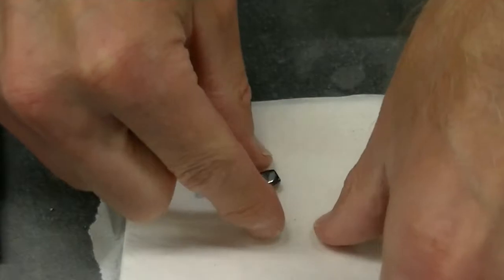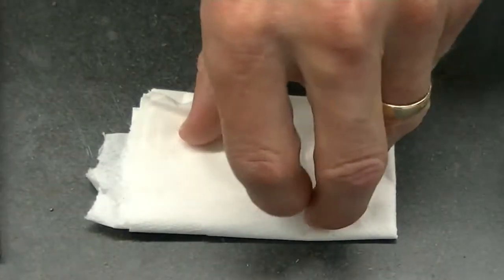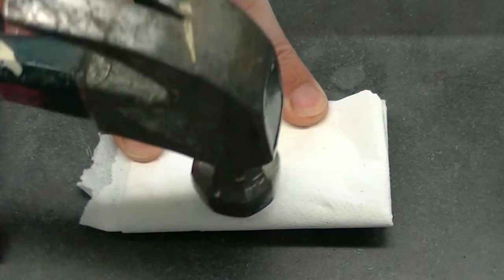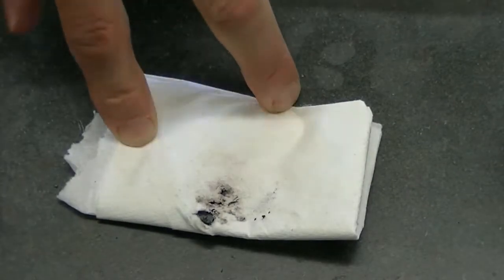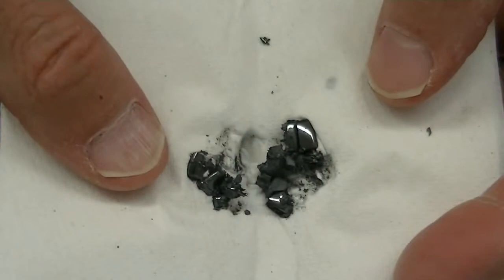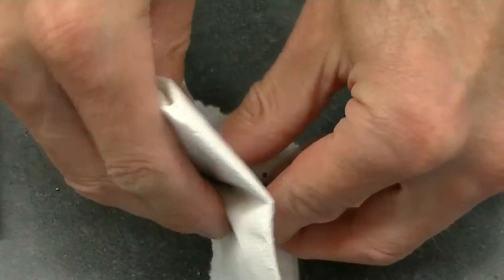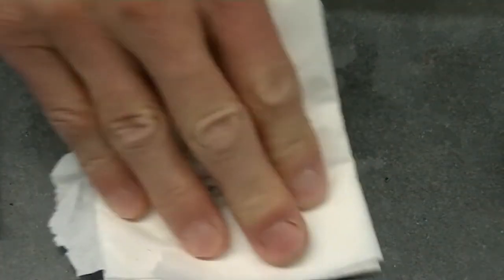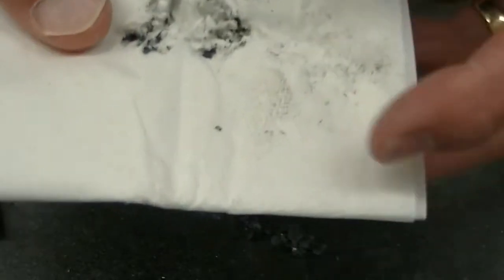We'll start with the beads sold as magnetic hematite. I'm placing it in a paper towel that's been folded several times. I'm going to pulverize it with a hammer. Let's take a look at the resulting powder.